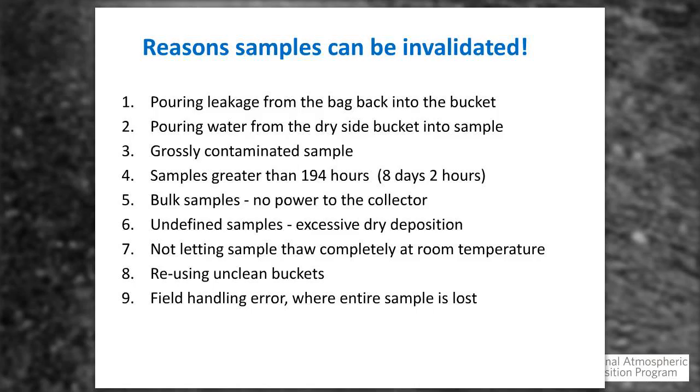What I would like you to do before you put that on your dry side is to take a magic marker and write "dry side only" on it. That way it doesn't get mixed up with the current used buckets that you're going to ship back to Cal. And number nine, field handling error.